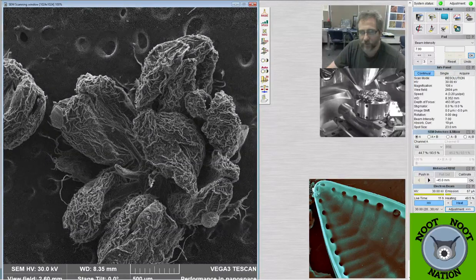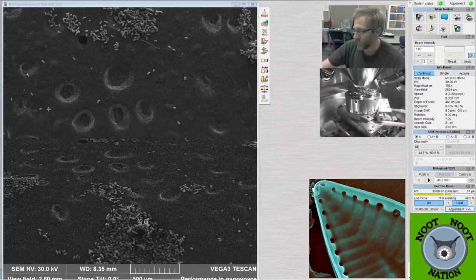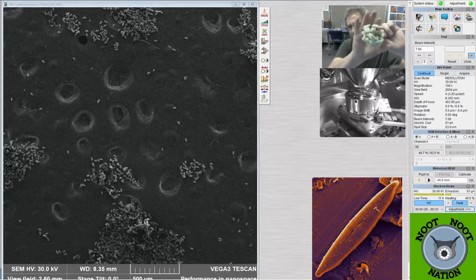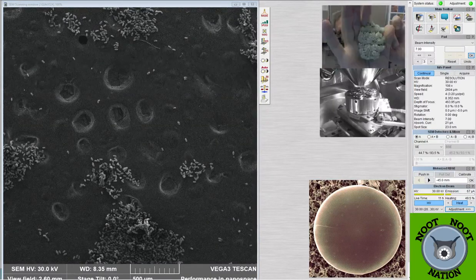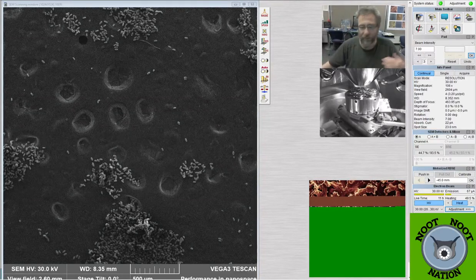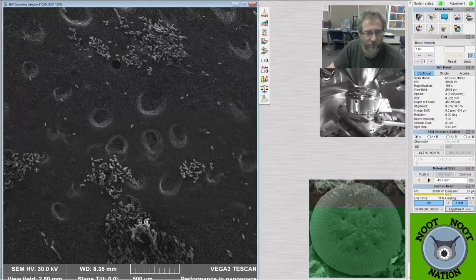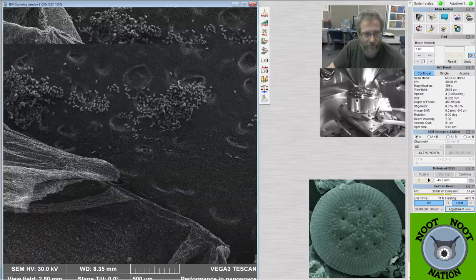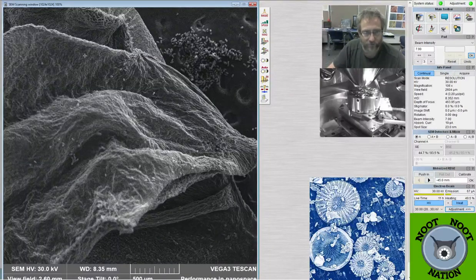Let's see, we have one last flower. This was a sort of bush flower. This is leather leaf. So leather leaf looks like this. The actual flower that I sampled looks like this. Let's see, can you see that? I guess I could try to get a little closer. There, now I can kind of see what I'm doing. And the bees are usually all over this stuff. It's got a bunch of little fronds with pollen all over it, and you can see the pollen just went nuts when I threw it down on the stub for this one, so it's all covered with a bunch of little rice grain looking things. And I think somewhere on here I also stuck down a piece of the flower, so we can go look at that when we're done with the pollen pick. You can see this is all pollen stuck to the outside of it as well.